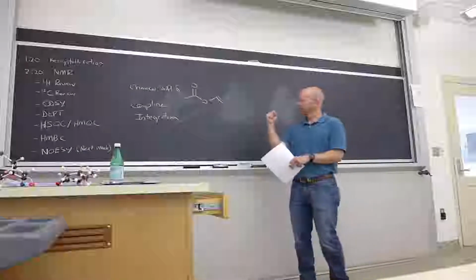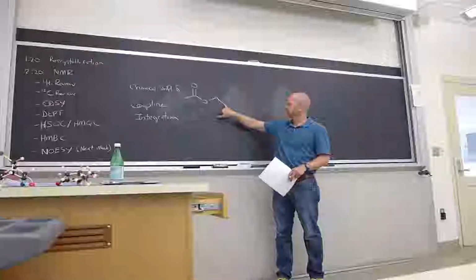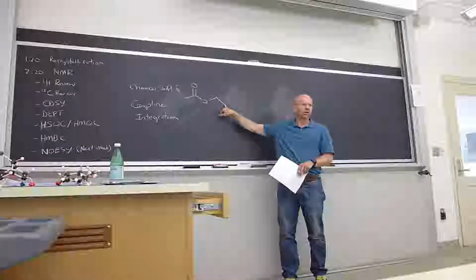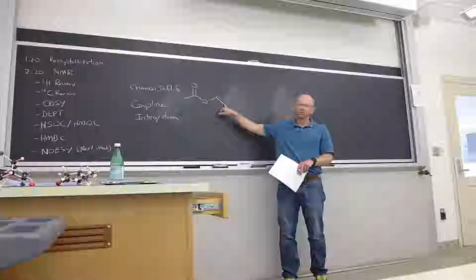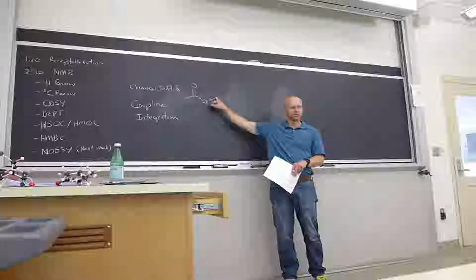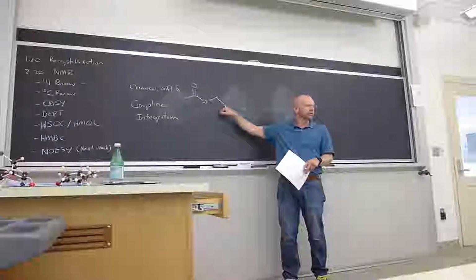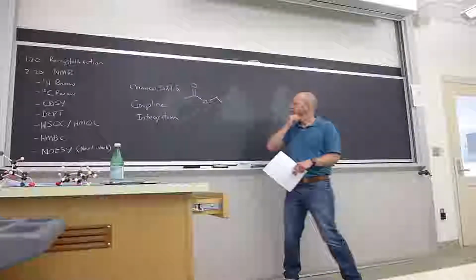So that's scalar coupling, right? That's coupling. And let's just do a quick example. So this methyl group right here, there are protons there. How would we determine what the coupling pattern or the splitting would be? It has two buddies. If you look next door, there's a proton group here that has two protons in it. And so we would expect that signal to look like a triplet. Yeah, so it splits n plus 1, right? It splits one more than is in the neighboring group. Okay, that's the most simple kind of coupling.